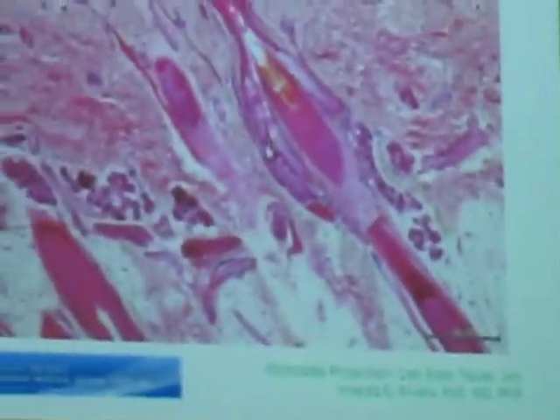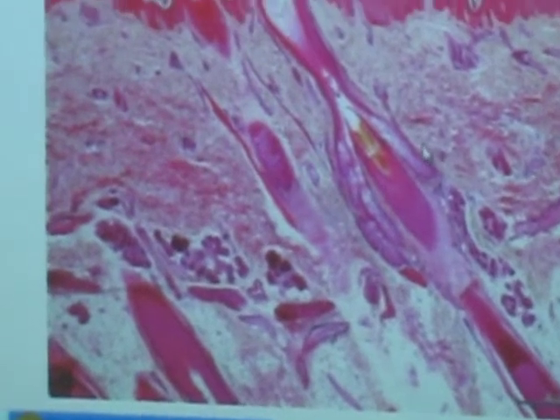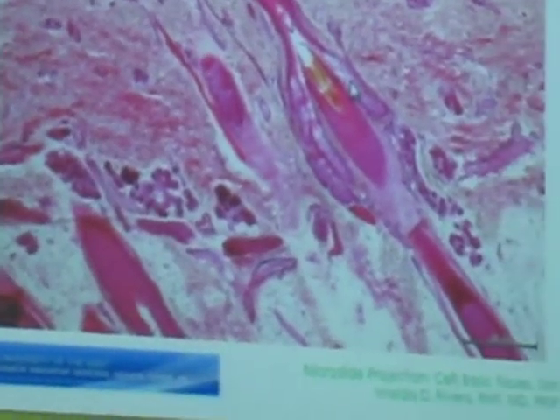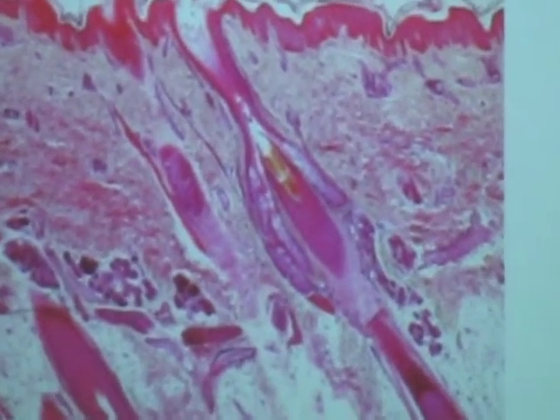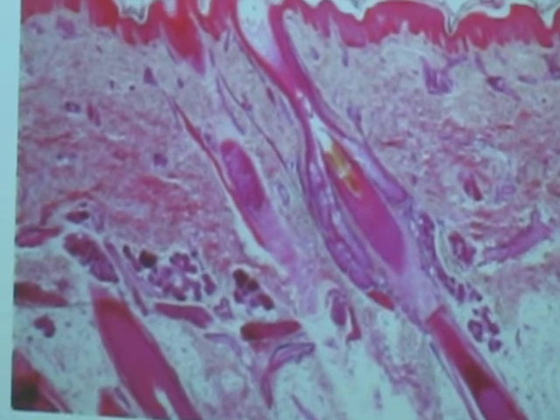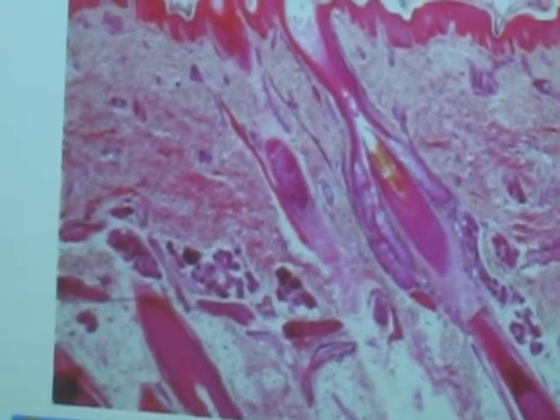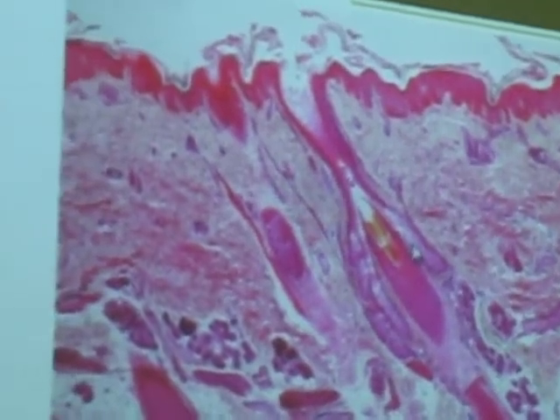Classify pointed gland according to gland cell participation. Holocrine. Holocrine gland. Classify pointed gland according to the type of secretion.